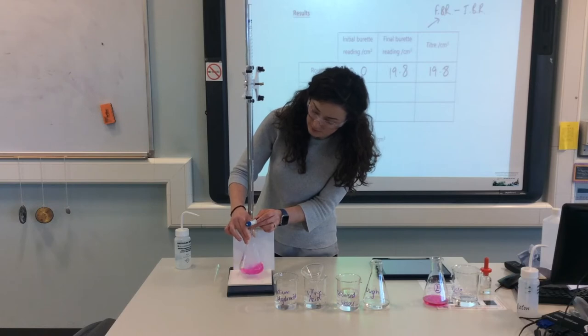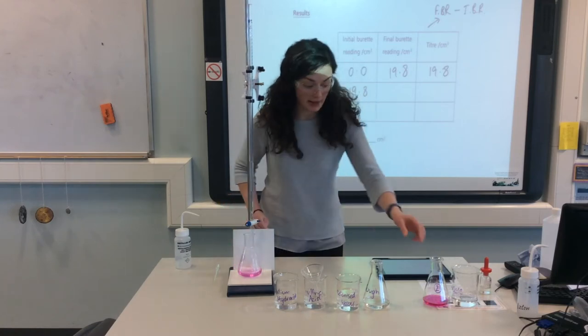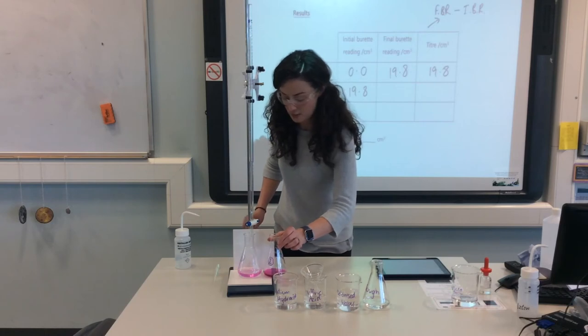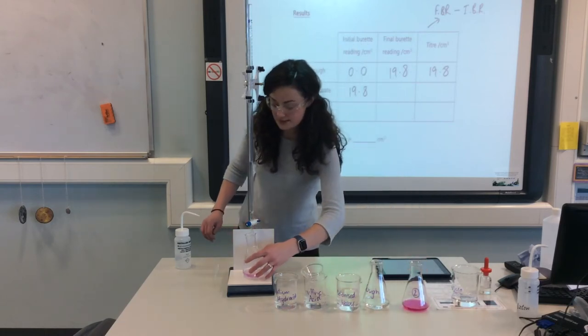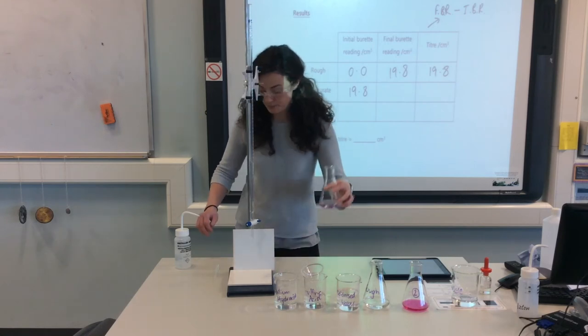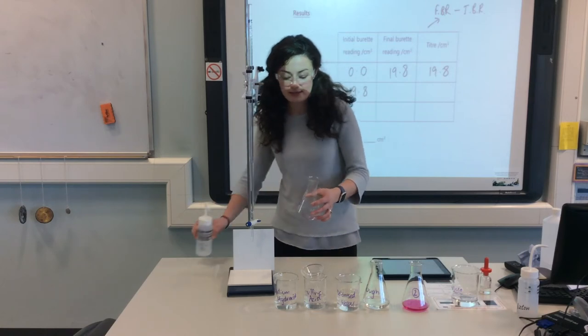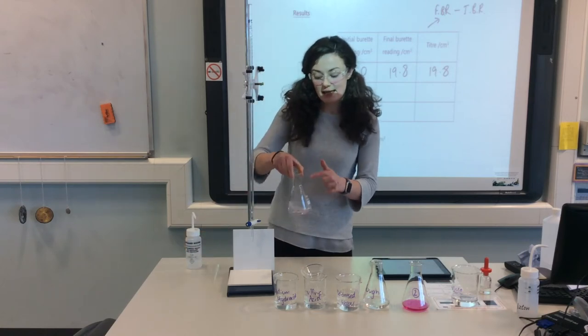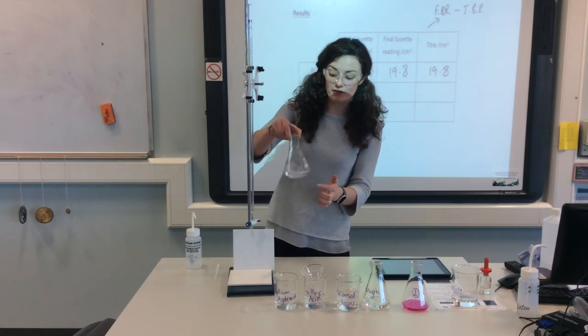than my rough titration. So hopefully you can see the pink colour is starting to fade. I'm going to stop it at that point. Hopefully you can see that pink is less intense if I compare it to this one. Hopefully you can see the difference in the intensity. What we might do at this stage is just do a quick rinse around. So get your conical flask and just do a quick rinse. That means any of the solution that's been added from the burette and has splashed around the outside then gets added.